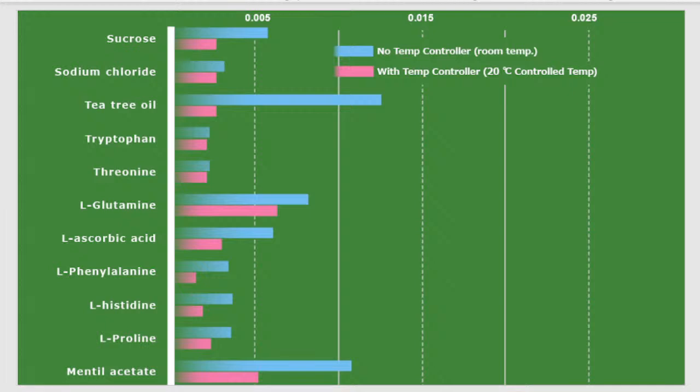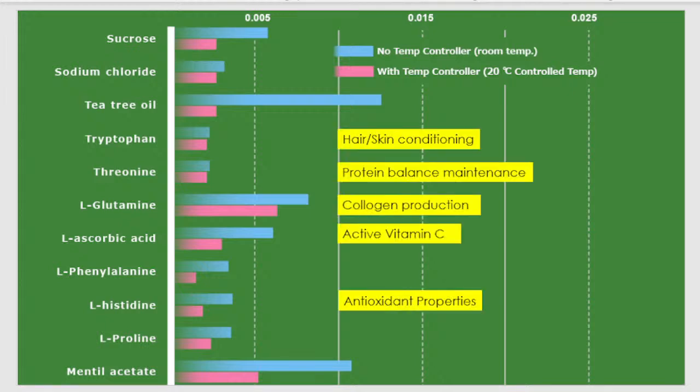Now, this is just speaking about temperature control in general. There are many ways to control the temperature. We're going to see the traditional way in a bit, and also the new way, which is, well, not new, but kind of new, which is the temperature control by Peltier. Okay, but this chart just speaks in general about controlling the temperature. So I mentioned those substances before.